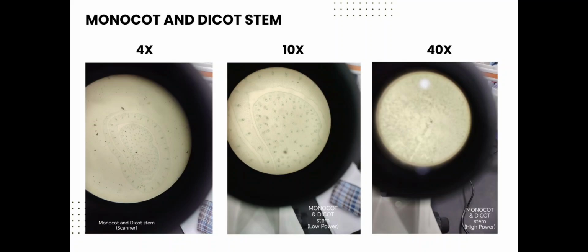Under high power, we zoom in on the internal details of the vascular bundles at this magnification. You can observe xylem and phloem tissues more distinctly, although the clarity is slightly reduced in this capture.